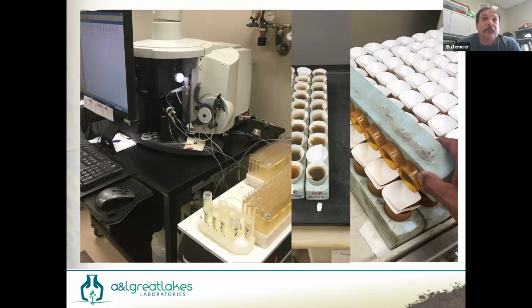And with the Mehlich 3 acid that we are using, we can collect all the nutrients in one step. If we went back 20 years ago, we would actually have to scoop that sample 5 times to get all the nutrient data. We can now do it in one. A 300% increase in productivity makes a huge difference.